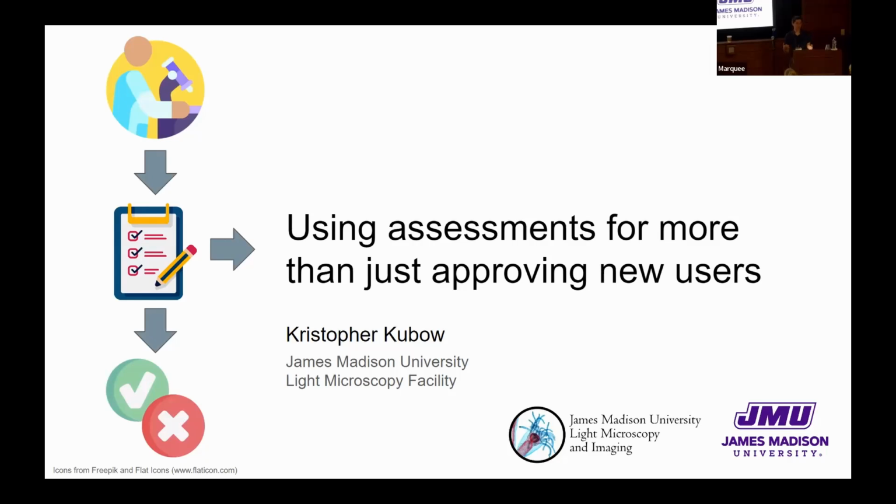But really, assessments can do a lot more than that. So carefully designed assessments can provide a rich source of information that can tell you about your trainees, can let you know if your training is working or how well it's working, and also give you a quantitative measure of that. So to illustrate, I'm going to show you some data from a study I conducted at my core.